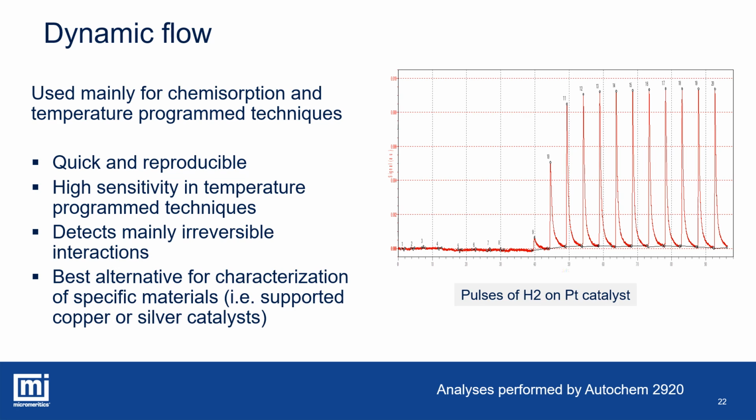A point of remark: the purity of the carrier gas must be very high because the carrier flows through the sample for a long time, and the presence of impurities, like for instance oxygen in nitrogen, might change the composition of the surface metal during the chemisorption process.